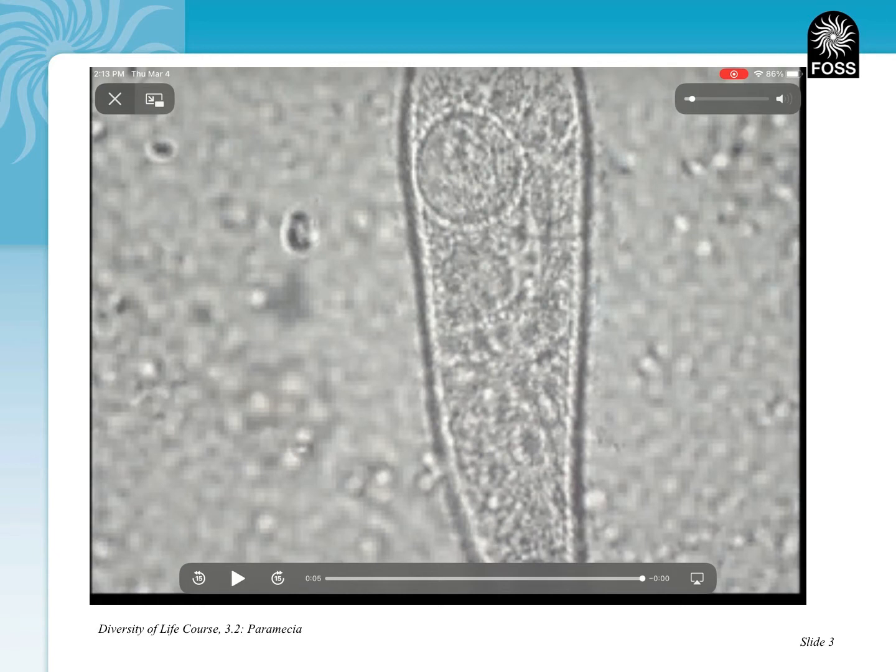Watch it again. Notice that thing in the middle closes. So that's an interesting feature within the Paramecium, that little opening. It might be a food vacuole or a contractile vacuole that lets waste in and out, or lets food in and out, or lets water in and out of that structure. So the Paramecium with that shows us a couple more things, that it actually has evidence of life and that it is a living thing.